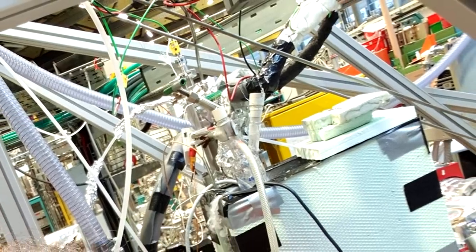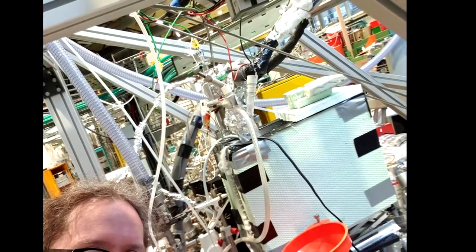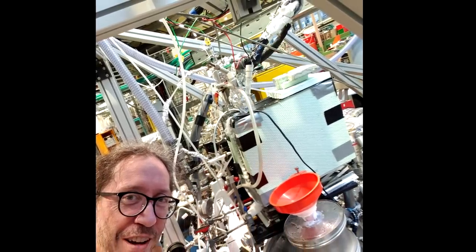For the past week or so I've been doing an experiment at a synchrotron. The details I'll come back to later because eventually this will get published in the literature. But what I want to focus on for this video is just the weird stuff that liquid ammonia does in a vacuum chamber.